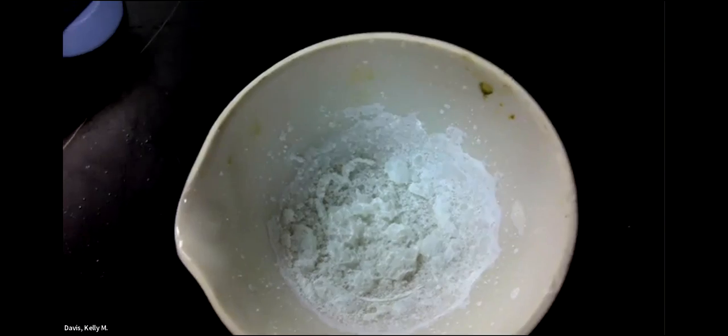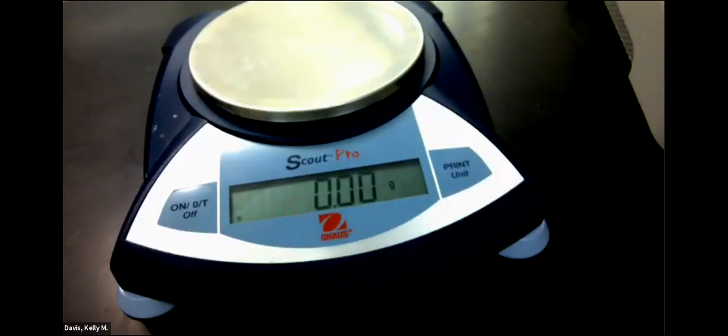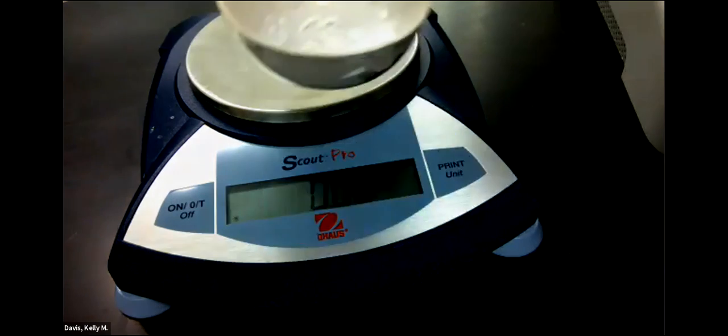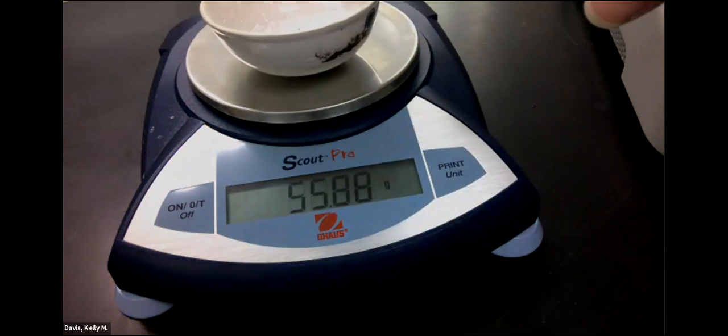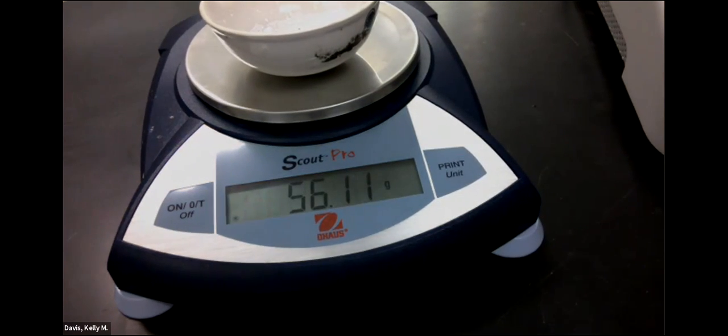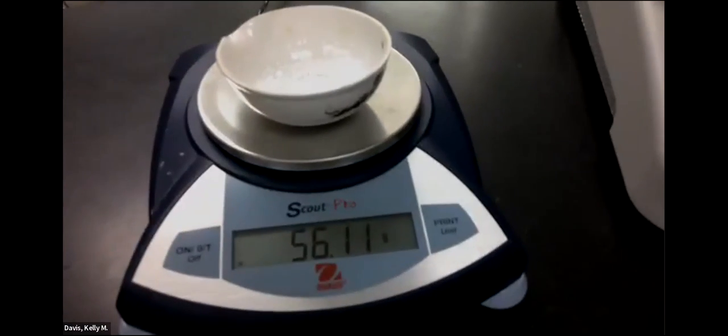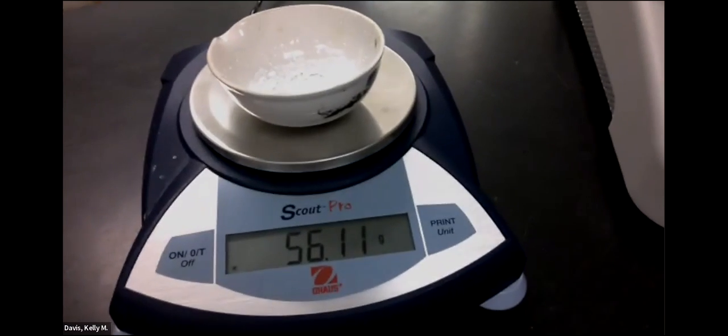It's cooled off a little bit. I want to put it on the balance and get the mass. This will be the mass of the evaporating dish with the magnesium chloride. Let's see if you can see that. So it's 56.11.